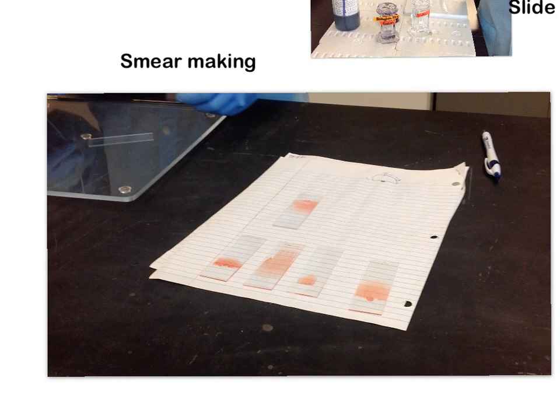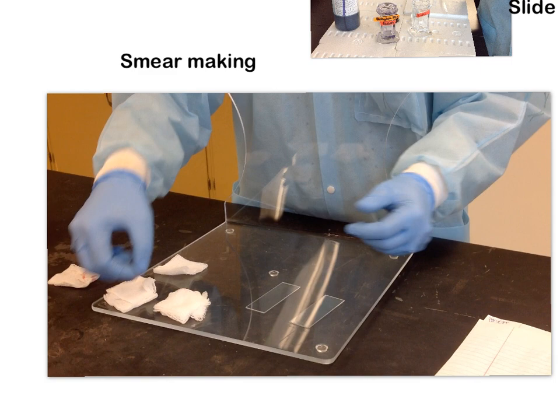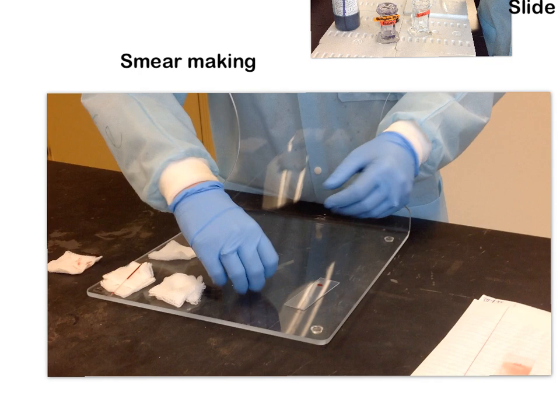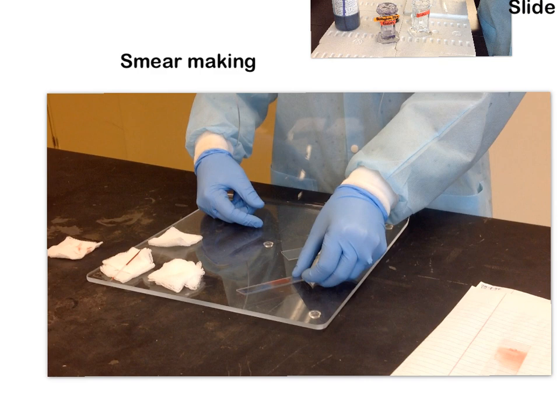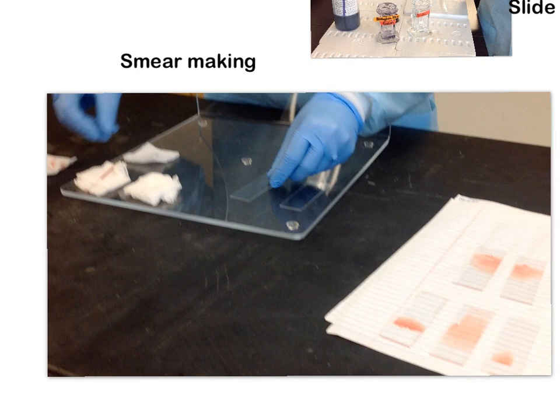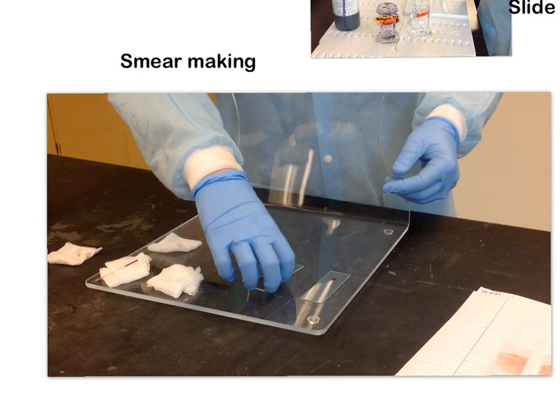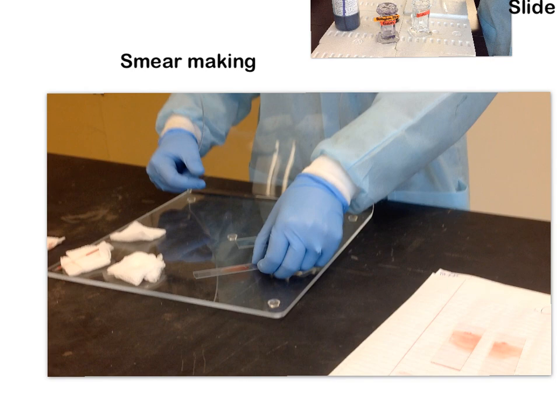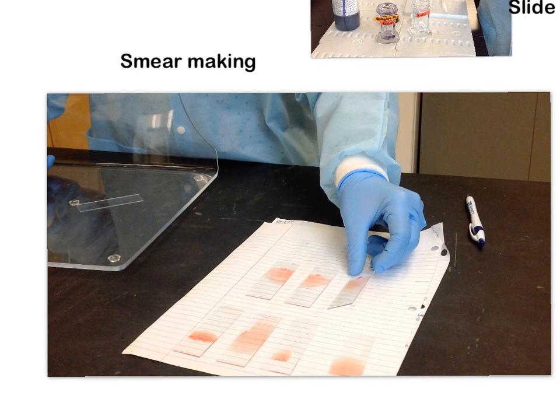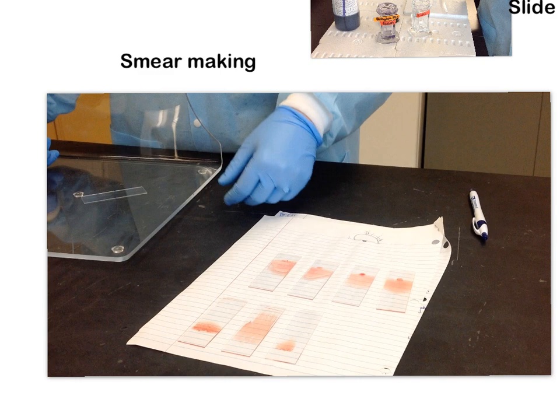Once you do a few of these, you'll get the hang of it. A 1 to 2 millimeter drop of blood about an inch up, spreader slide at 30 to 45 degrees halfway up the specimen slide, pull back until you hit the drop, wait for it to hit both ends, then push. What we're looking for is that nice feathered edge — not long streaks like a comet tail, and not a flat top. We'll add these to our collection of good smears.